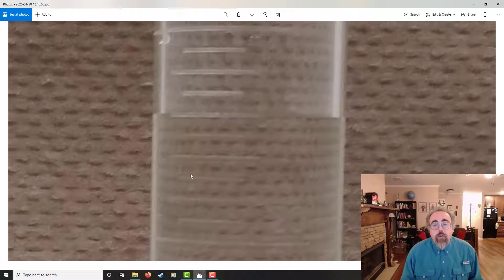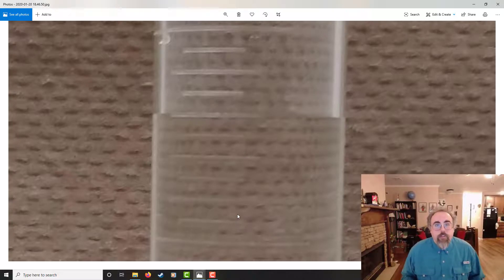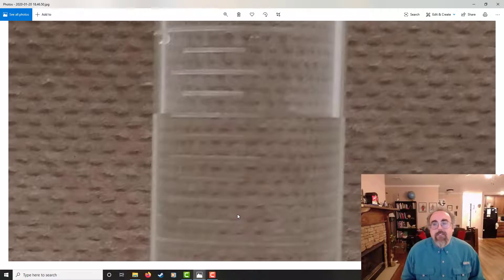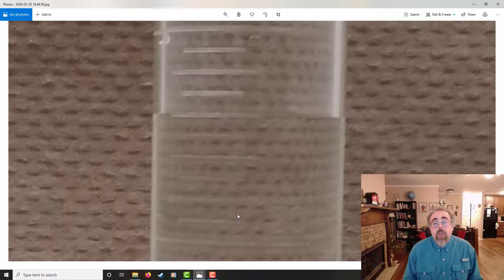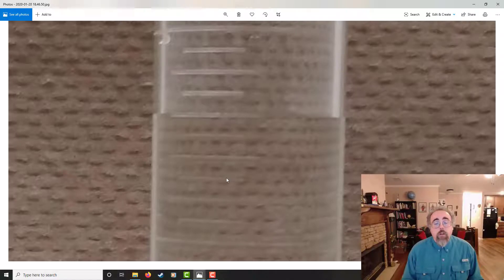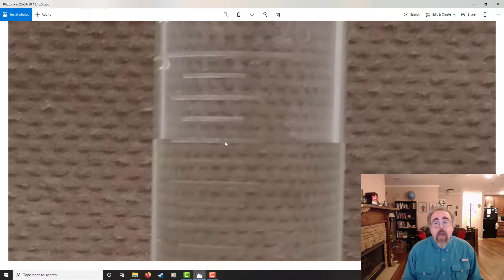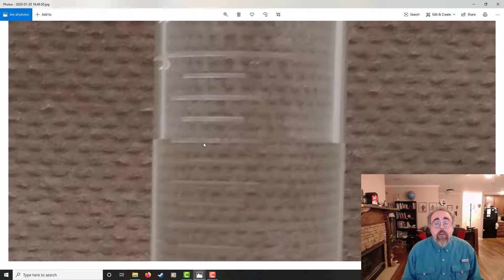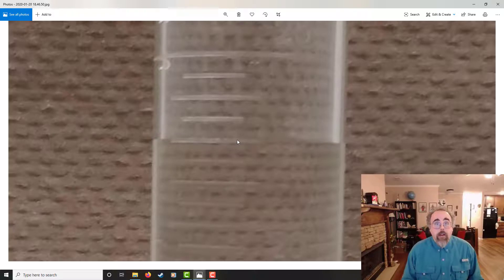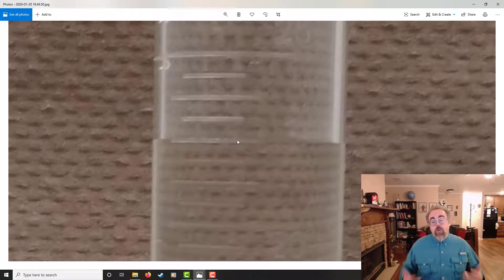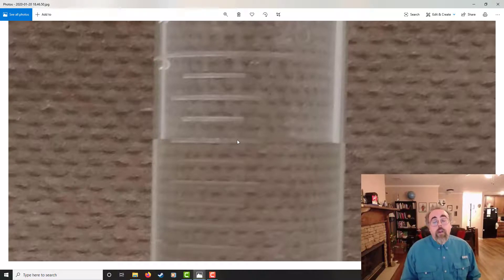The slightly larger ones are going by milliliters, and then the slightly smaller ones are going by halves. Okay, so first thing to catch is you may not always have nice powers of tens for your lines. It's nice when you do, but hey, this isn't bad. Halves aren't bad. So I'm going up here. That's 20, 0.5, 21, 21.5, 22, 22.5, 23. And to be honest, that's pretty much right on the line. I think my camera was a little crooked. This is right on the line. So if I'm recording this, I'd say it's 23, but I wouldn't just say 23. I want to communicate to everyone that is right on the line. So I'd say 23.0.